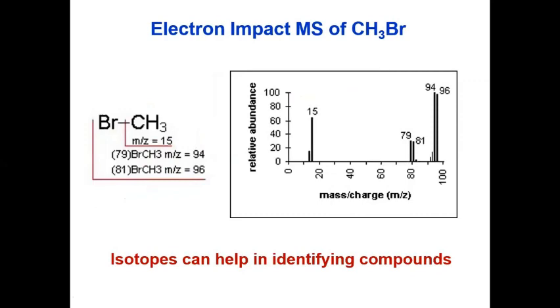Then the electron ionization spectrum of methyl bromide. This is the mass spectrum for methyl bromide. We can see the possibilities of breaking a molecule through the bond between carbon and some group, or maybe a core electron.